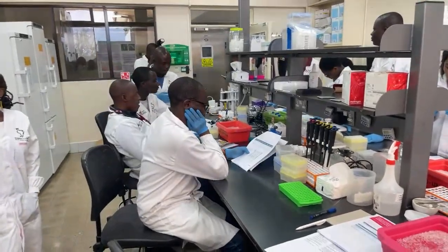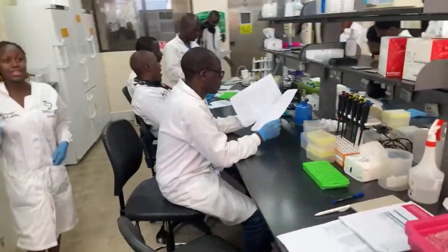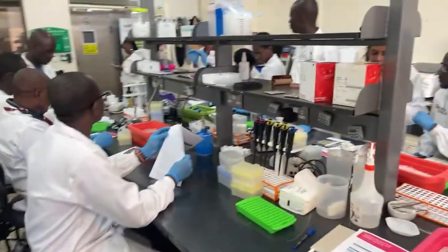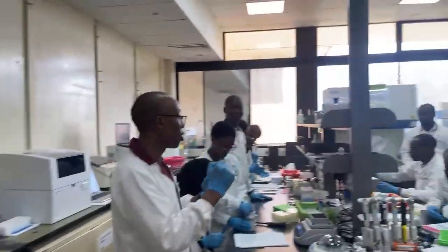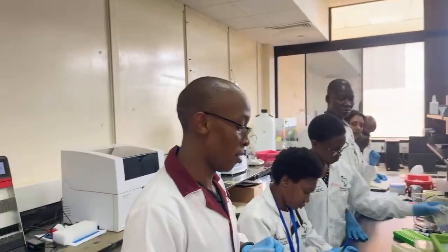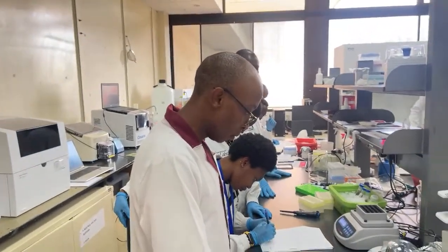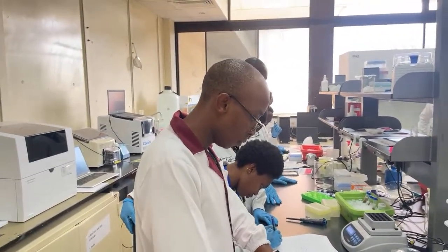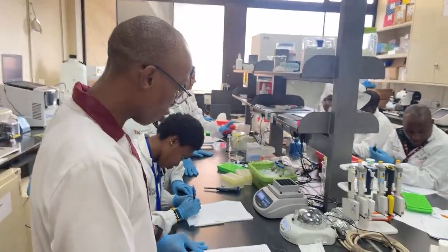So this is an important step, guys. You need to have a new tube, 1.5. Remember, the supernatant is a precious material. Pipette it out into a new tube. Remember not to disturb the pellets. So this is where your DNA is. You're going to see it in a short period of time.